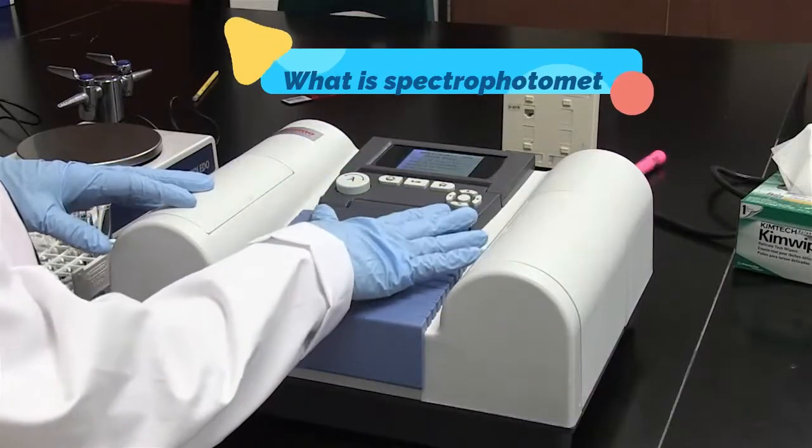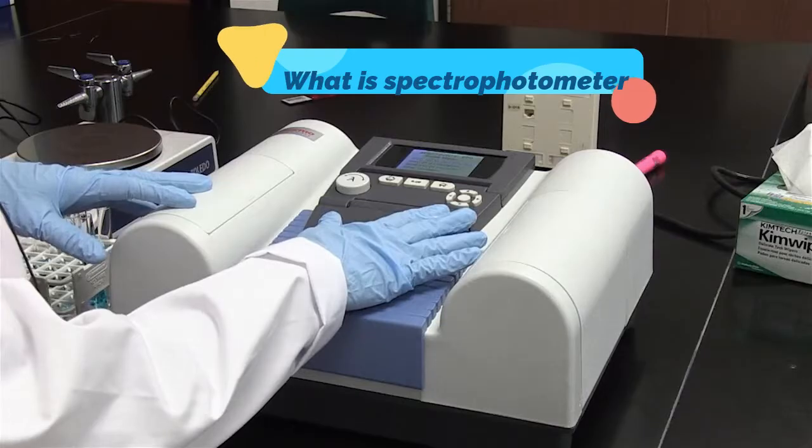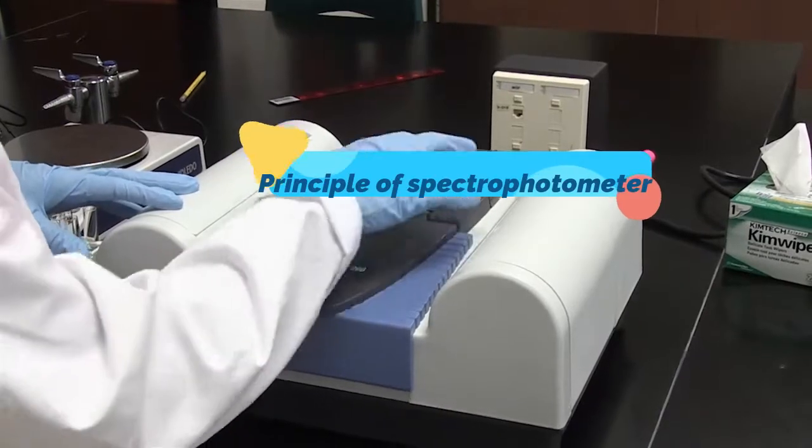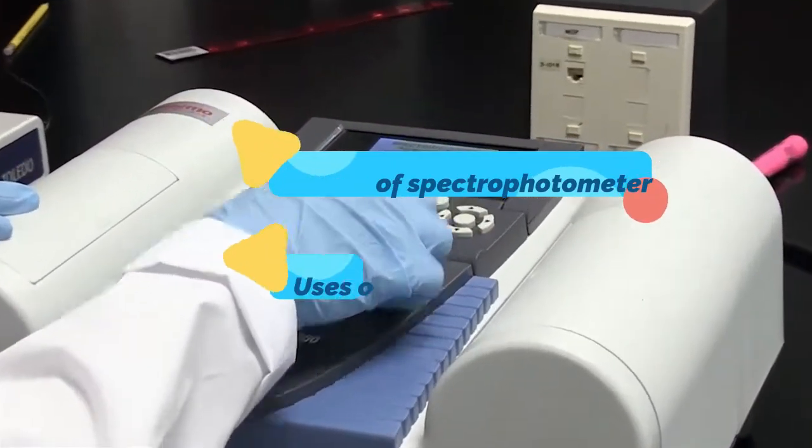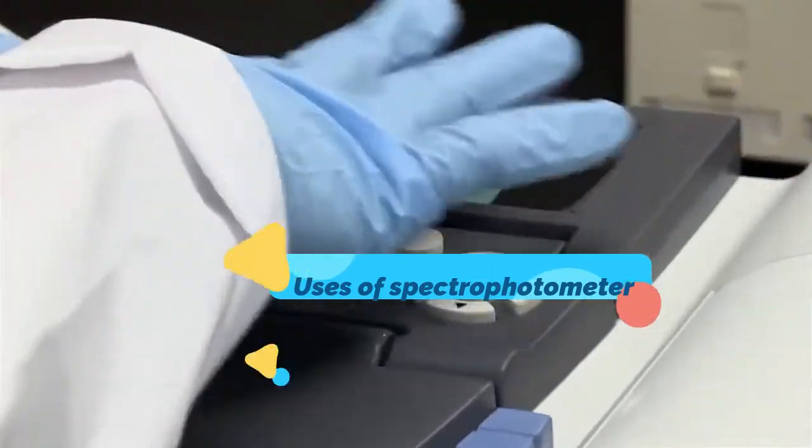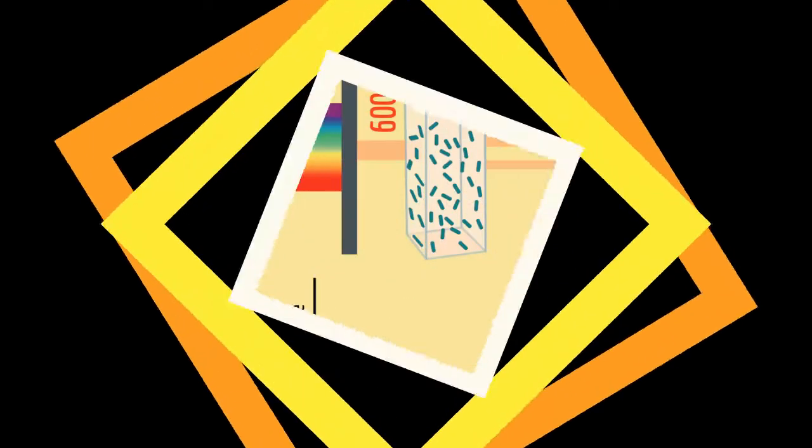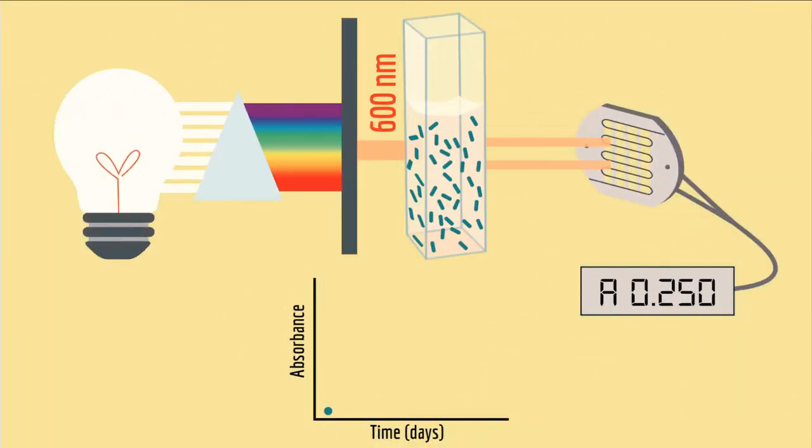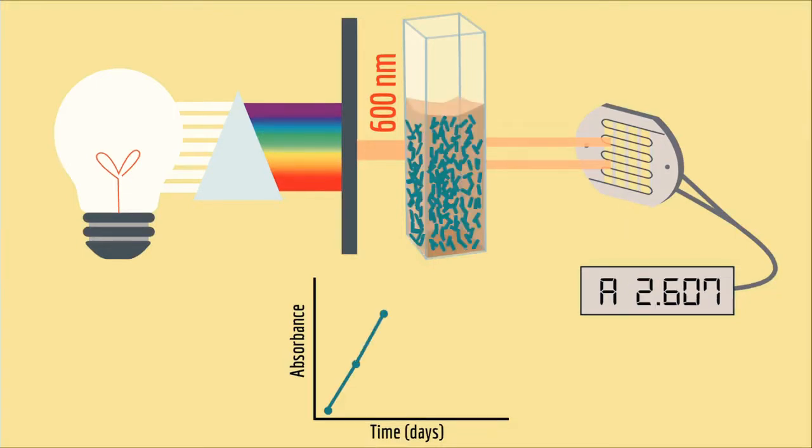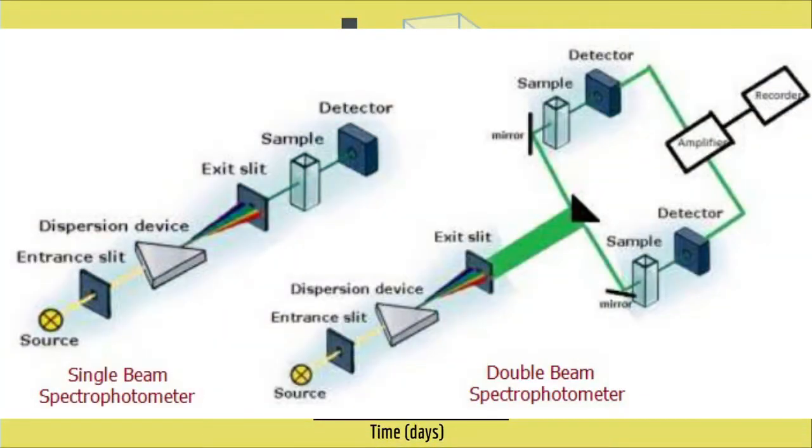This video includes what is spectrophotometer, working principle of spectrophotometer, uses of spectrophotometer, and how to use spectrophotometer. The spectrophotometer is an optical instrument for measuring the intensity of light in relation to wavelength. Based on the amount of light absorbed by a colored solution, a quantitative analysis of the solution can be done. There are two classes of spectrophotometers: single and dual beam.